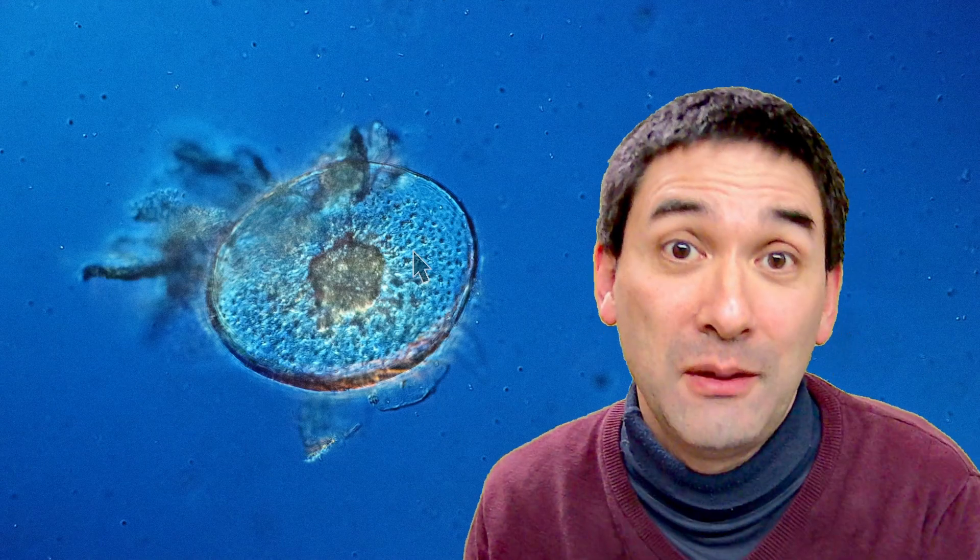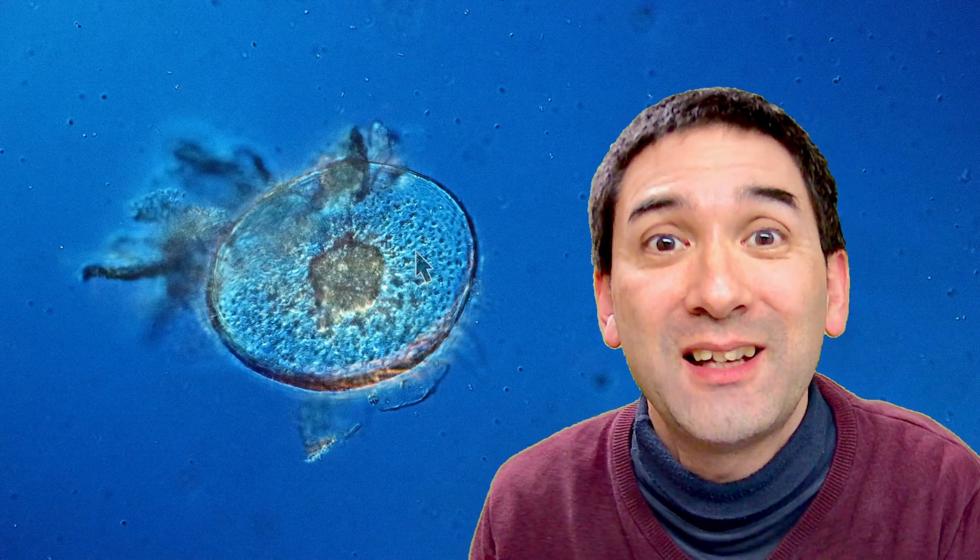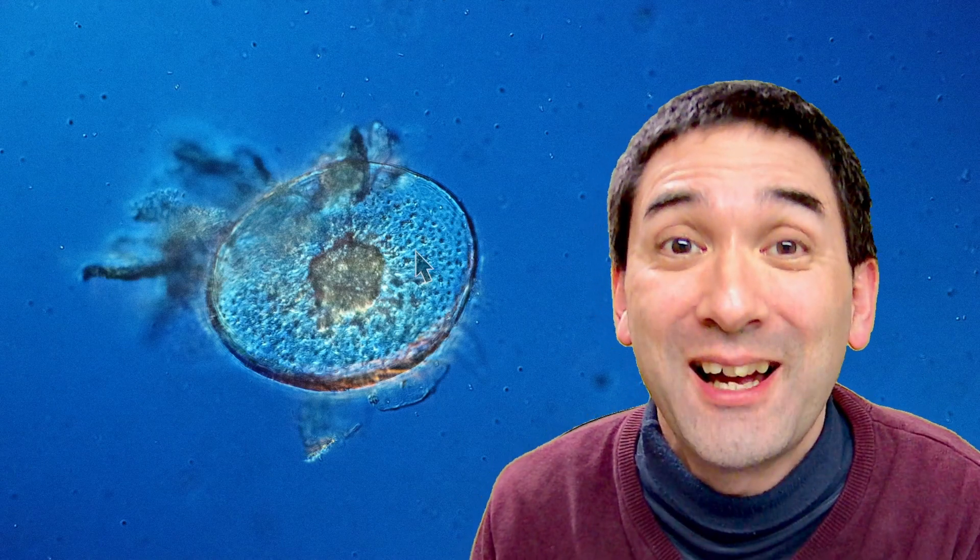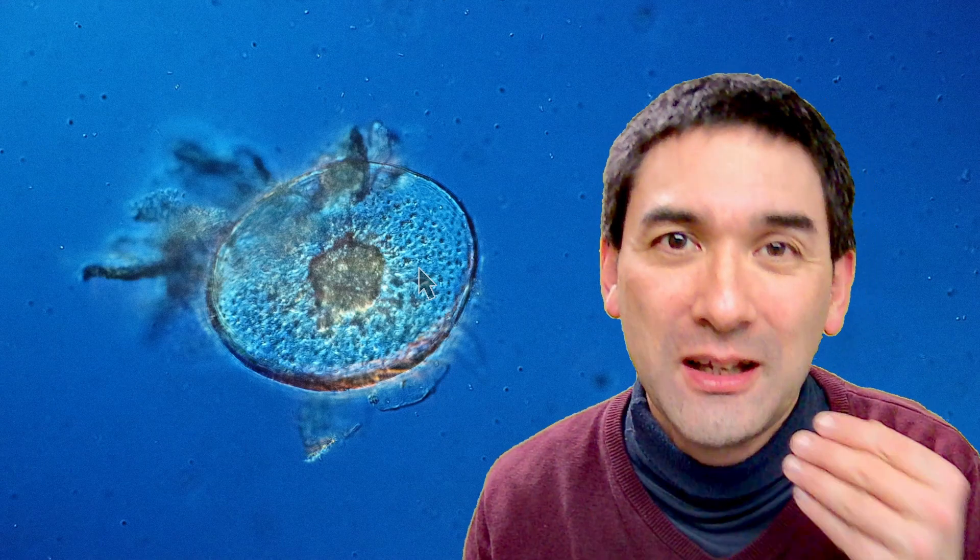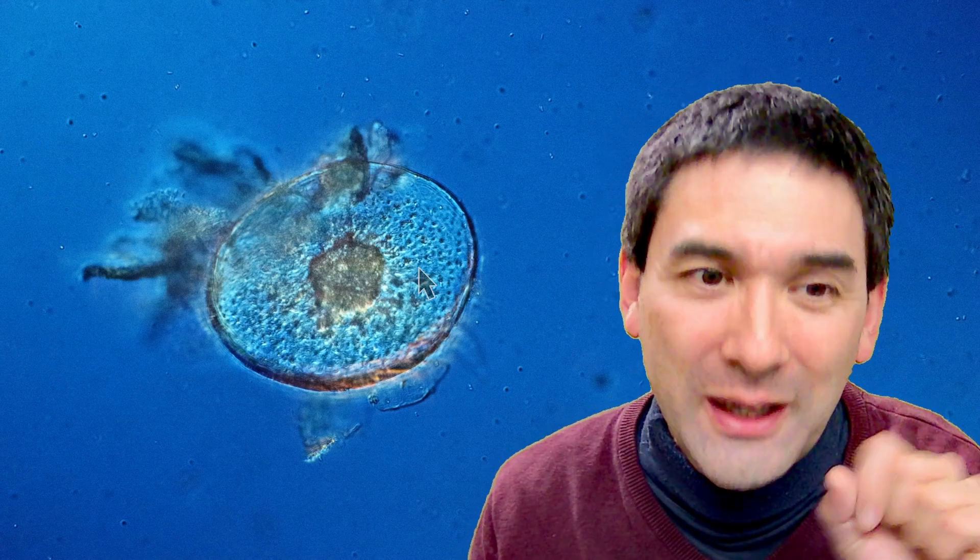And because of the hair, the beard was cut so thinly, I had no problems actually mounting it on a slide. And because normally when you put hair under the microscope slide, you're actually seeing it only from the side and not actually right head on.